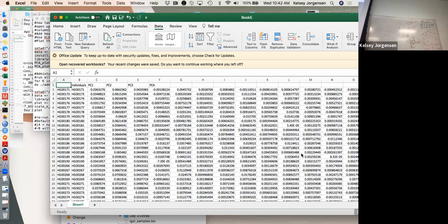How are you doing? Are you at that step? Yes, I am, in a column. So add PC, oh, so you need to open it in a different way so that all of this data is in separated columns. So exit out and just open a blank Excel.